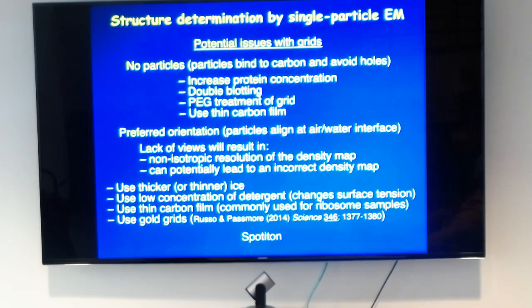I don't think it's really robust yet. But I do think with test specimens, it's been pushed. With actual biological samples, maybe. But for my particular protein, the tilting never really got any better than 4.5 angstrom. Oh, yeah, that's horrible. I know. I was telling the collaborator it looks great, but 4.5 is a lot better than nothing. I agree.